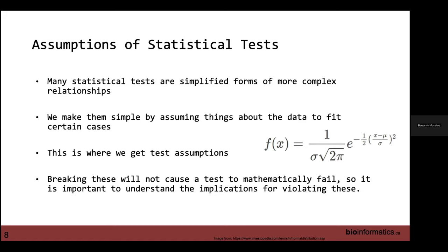So for example, on the far right-hand side there, I'm sure you're all at least tangentially familiar with what a t-test equation looks like. It's not particularly nasty looking. The equation over on the right there is the probability mass function that a t-test uses. So if you wanted to get really advanced and skip some steps, you could fill in your information into that equation and integrate your area under the curve. But we can also assume things and just plug it into a t-test, which is far nicer.